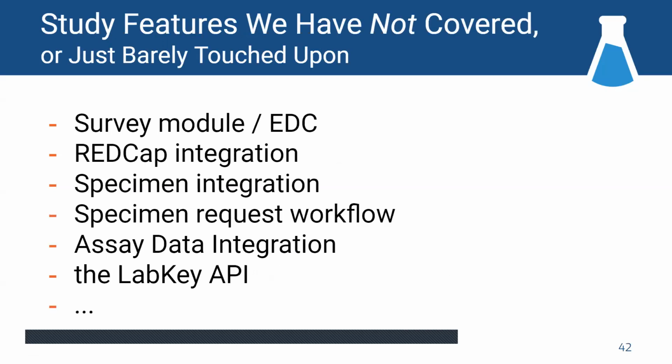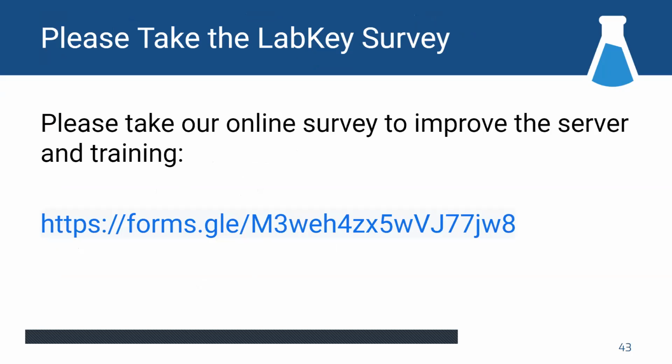Also, there's a much broader set of features we haven't looked at. We have a survey module that lets you do EDC directly on the server. If you have REDCap data, you can pull it into your studies. We didn't even touch on specimen integration. And we didn't even touch on assay data integration. That's all stuff that's just right there. We did take a tiny little look at the LabKey API with R. But again, there's just way more to do, way more coming as you keep going.